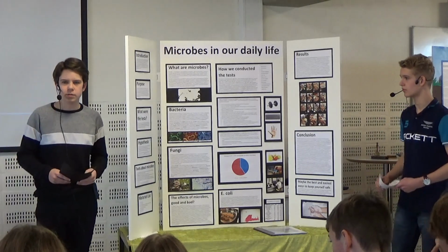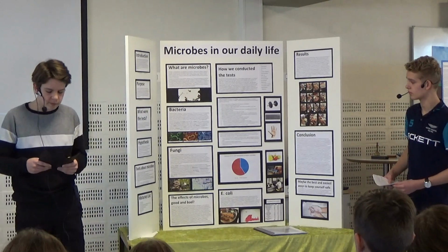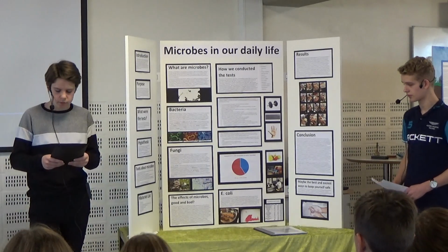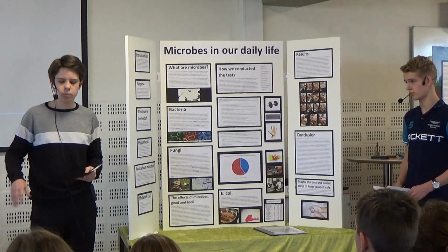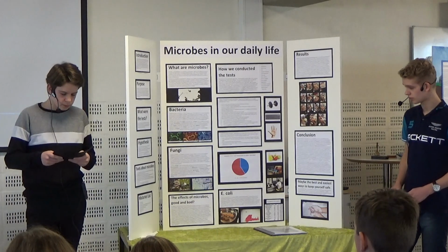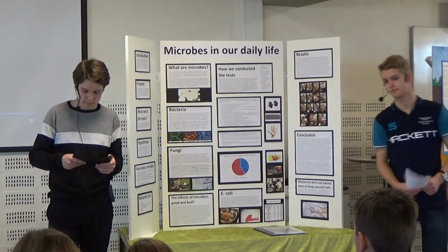Then we started counting the number of colonies of E. coli compared to the number of colonies in total, including fungus. What we found out was shocking. Out of 736 colonies that we have grown, that is just roughly, as some of the bacteria were very large and grown together in rows, around 300 of them were E. coli. That is nearly 40%. This is also shown on our pie chart.